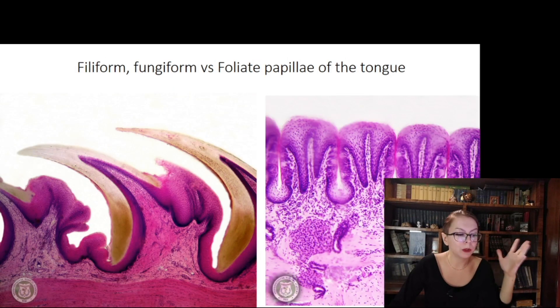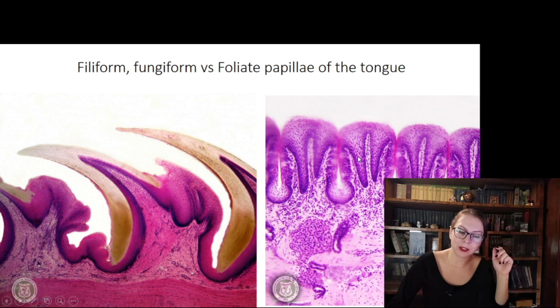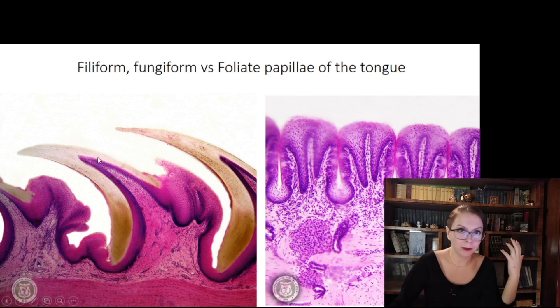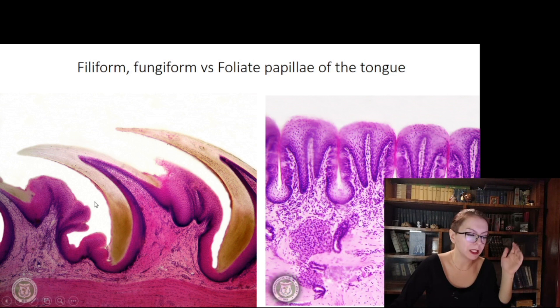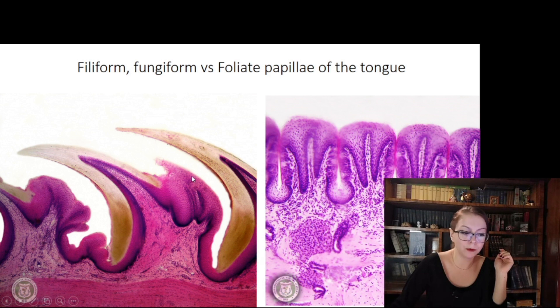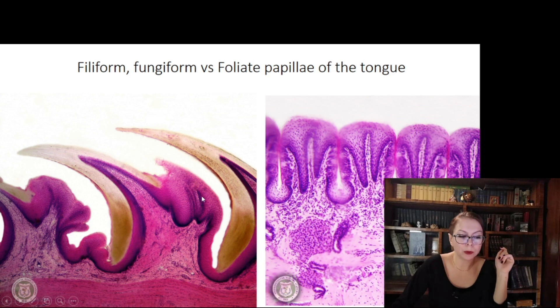Now we are talking about the tongue and comparing filiform, fungiform, and foliate papillae. There is no problem distinguishing filiform from foliate, but there can be difficulty distinguishing foliate from fungiform. Filiform papillae are well developed and bent backwards — as in a cat's tongue used for grooming. Keratinized epithelium is present in filiform papillae, while in fungiform papillae the epithelium is not keratinized. Also, taste buds are absent in filiform papillae but very well distinguishable in the foliate papillae.